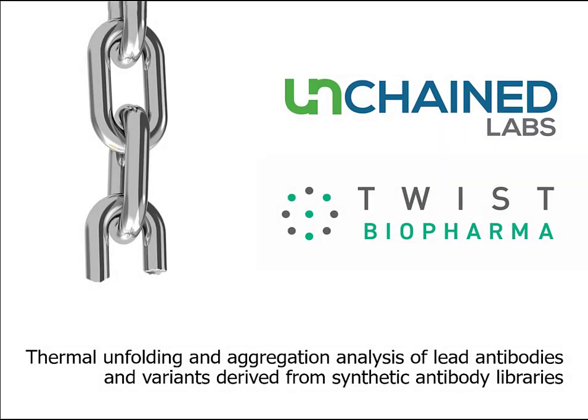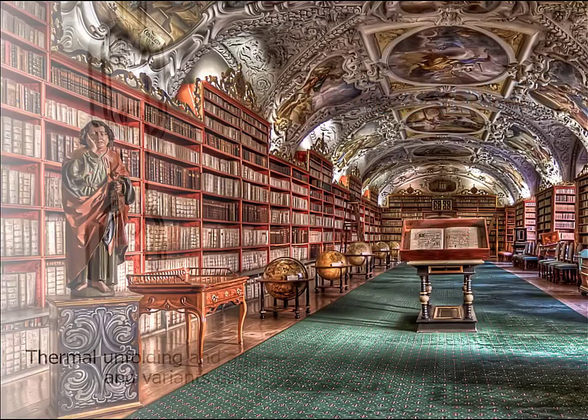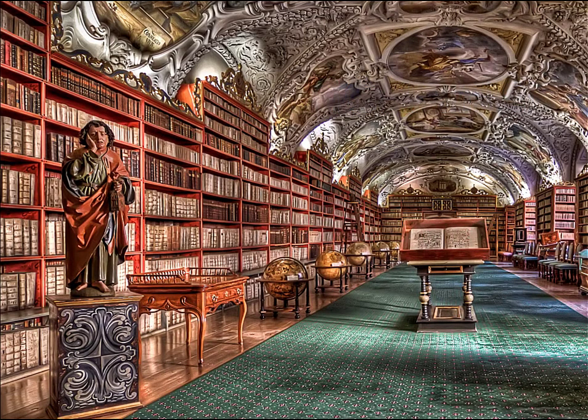Thanks for that introduction. I'll be introducing and giving some background to the thermal unfolding and aggregation analysis part of this webinar and the instrument used for much of the analysis. When dealing with a library of options, picking out just one option can leave you feeling a bit like the statue on the left, overwhelmed. In this webinar, myself and Aaron will talk about antibody libraries and how to use the UNCLE from Unchained Labs in a workflow to screen a library down to just the best performing options.